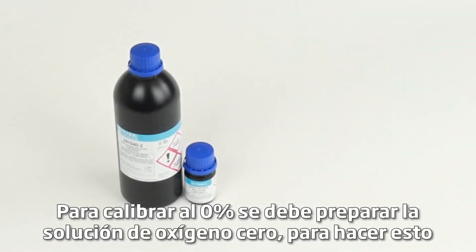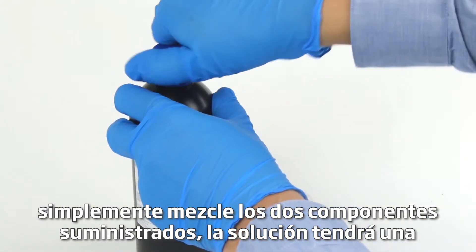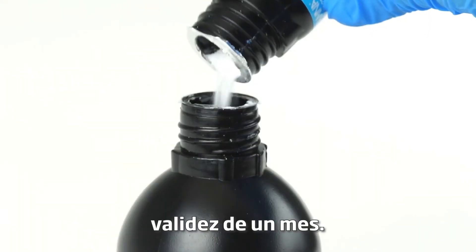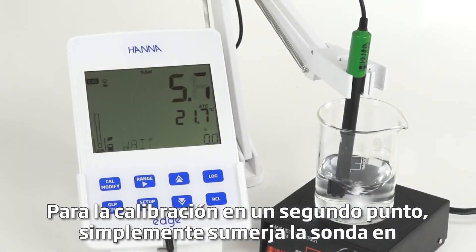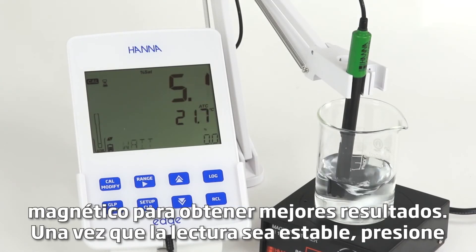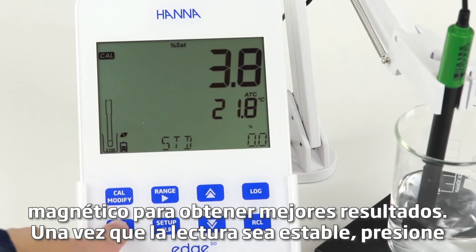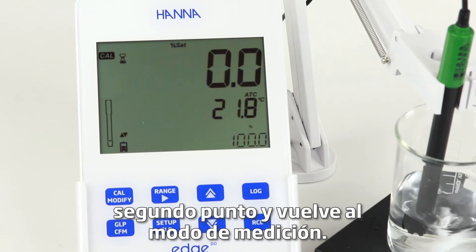To calibrate at 0%, the 0 oxygen solution must be prepared. To do this, simply mix the 2 supply components. The solution will be valid for one month. For calibration at a second point, simply submerge the probe in about 60 milliliters of 0 oxygen solution. Be sure to use a magnetic stirrer for best results. Once the reading is stable, press confirm to accept the calibration point. The meter automatically saves the second point and returns to measurement mode.